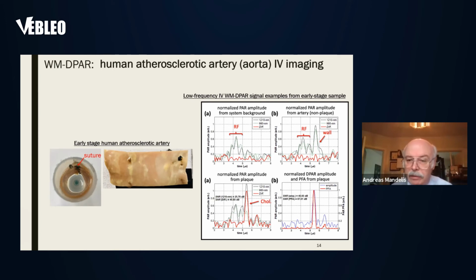Once the signal goes out of lock, the phase is almost digital. It either locks if there is absorption, or it's totally unlocked if there is no absorption. So the standard deviation is all over the map, which looks like wild signals up and down. If you divide by a large signal, you get essentially a zero. That's why it is the inverse of the standard deviation.